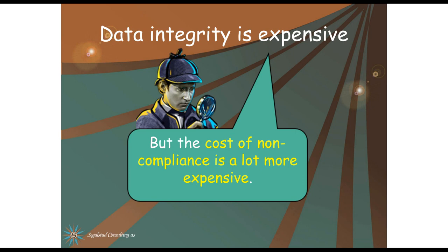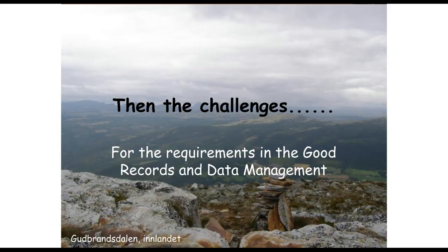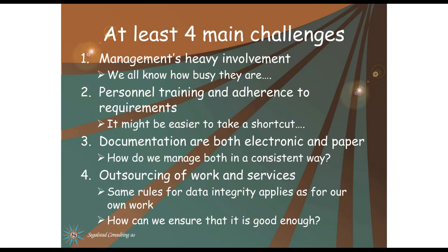Well, the same can be said for data integrity. It's expensive. I know two consultants who worked full-time for 6 months on getting the data integrity in a company in a lab actually, in a good condition. That sure is a lot more expensive compared to doing it right from the beginning. There are several tough challenges though, because there are requirements in good records and data management.